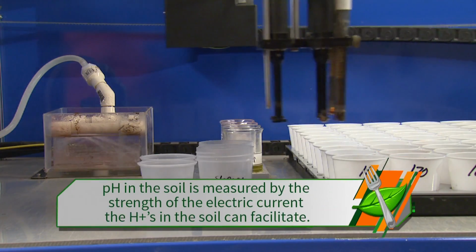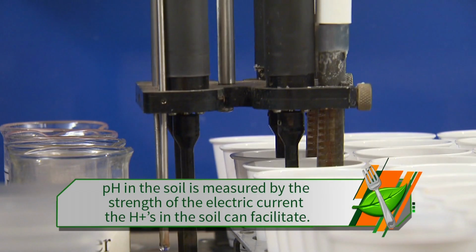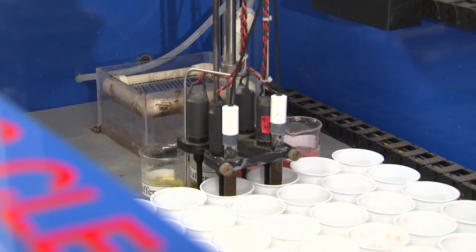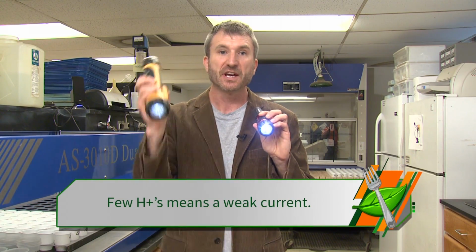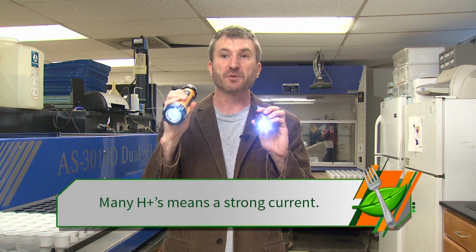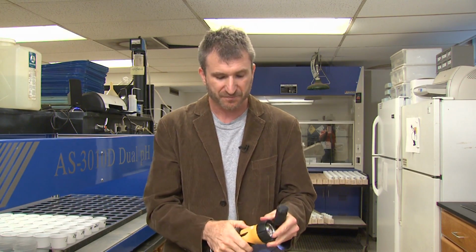And so what this machine does is it takes the hydrogen ions in the soil sample and it measures the strength of the electric current that it can facilitate. So if you have just a few hydrogen ions in the soil, then it can help move some electrons and it can facilitate a charge, but perhaps a weak charge. But if you have a lot of hydrogen ions in the soil, it can facilitate a much stronger current. And therefore, this would be a high concentration of hydrogen ions. This would be a low concentration of hydrogen ions because this one could facilitate a stronger voltage.